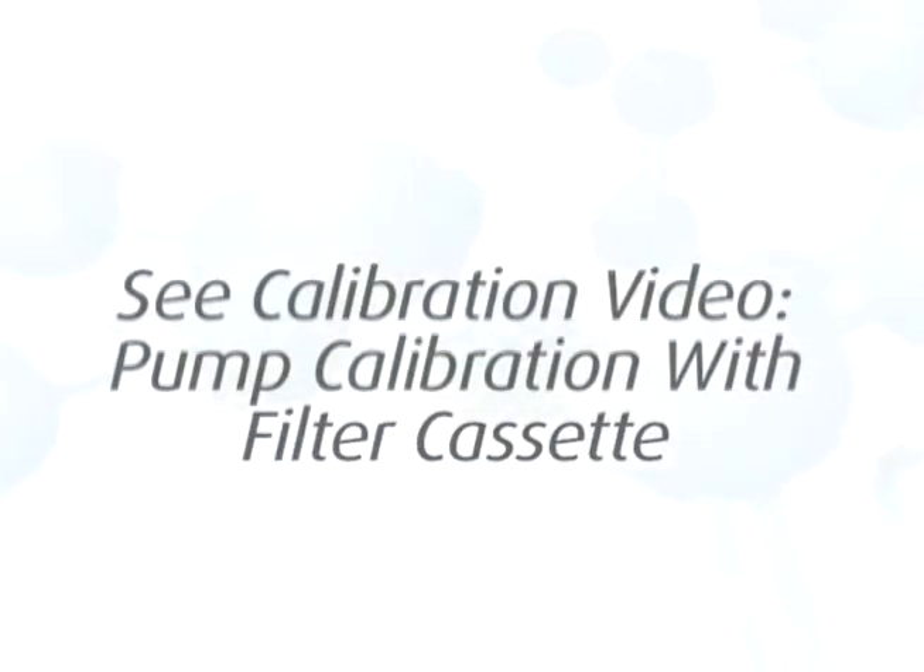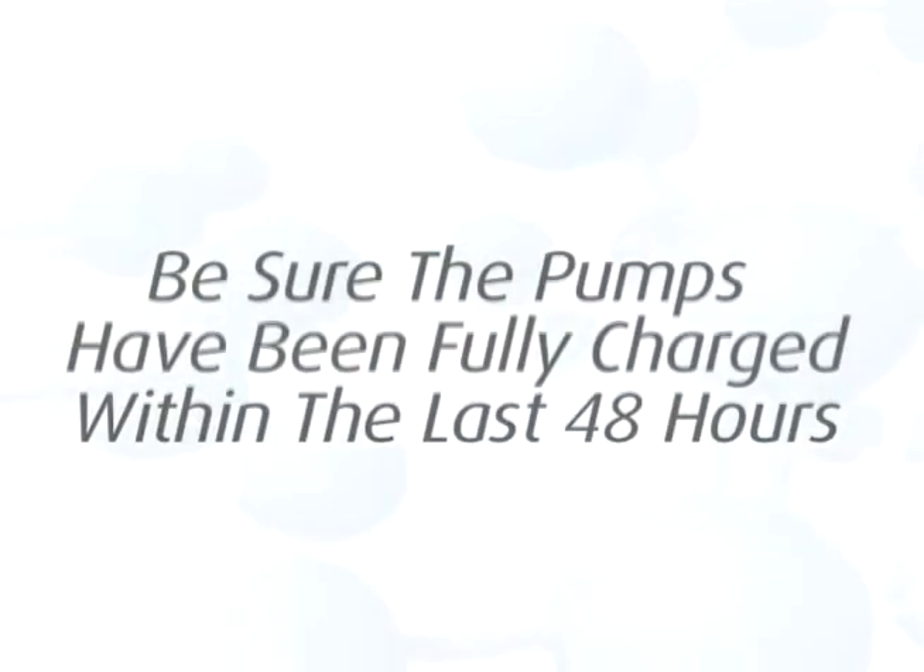If you need assistance with calibration for this method, please see the calibration video titled 'Pump Calibration with Filter Cassette.' To begin sampling, the pumps must be fully charged. If the pumps have not been fully charged within the past 48 hours, you must recharge the pumps prior to sampling.